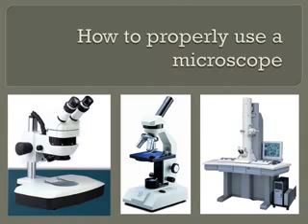There are many different types of microscopes out there. Dissection microscopes, as shown on the left, are used like a magnifying glass to look at the surface of something that's usually visible to the naked eye. You might use this type of microscope, for example, to look at the eye color of a fruit fly.